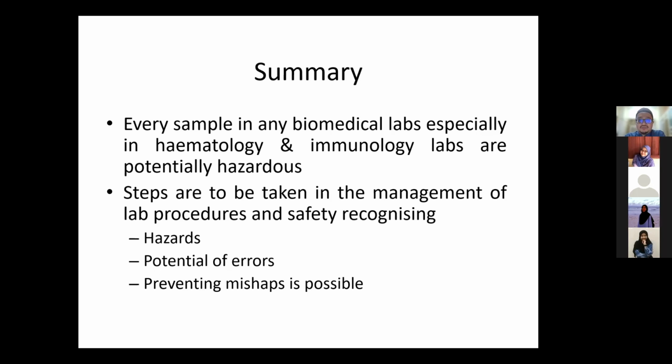And then steps are to be taken in the management of lab procedures and safety, recognizing hazards. We must know what is a hazard, what the definitions are. We must know what the potential errors are, and we must know that preventing unfortunate events is possible as long as we follow SOP. We take care, we pay attention to details. The lecture of today is part of this, part of your training. You will have many of these kinds of lectures again and again throughout your career. Okay, any question?